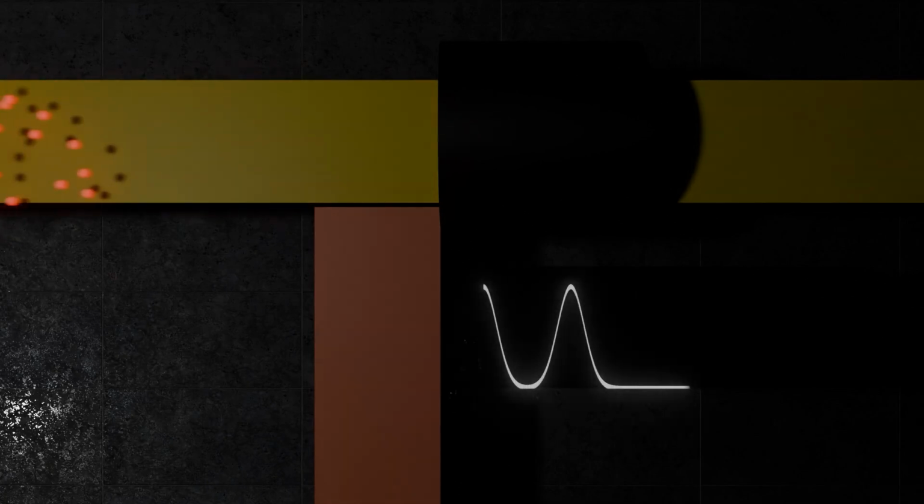Now, this detector just detects the intensity of ions, which means that as ions pass this point, this is what the output of the detector looks like. There. Now based on this data, you can figure out which molecules are passing when, simply because we know that molecules with higher charge to mass are here and lower charge to mass are here. Simple.